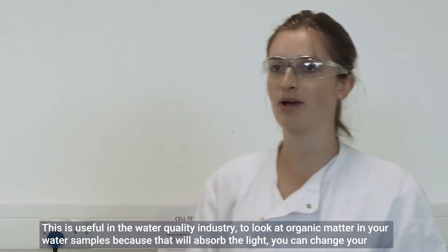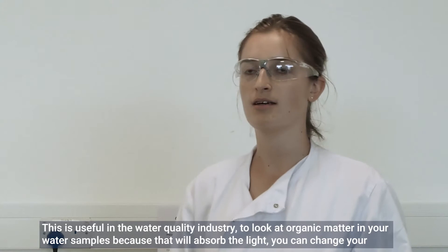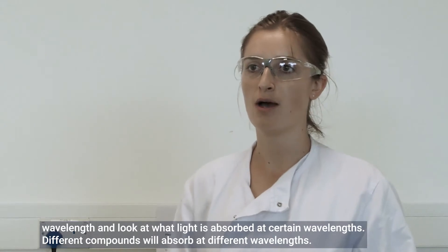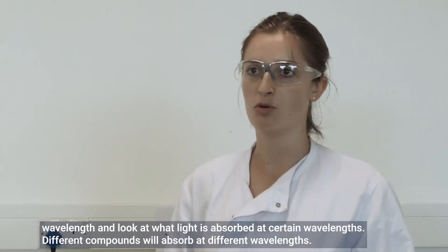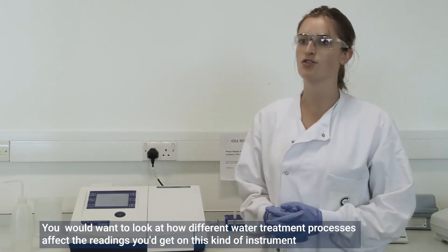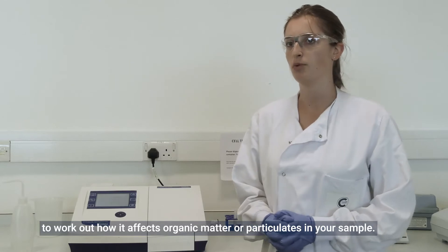This is useful in the water quality industry to look at organic matter in water samples, because that will absorb the light. You can change your wavelength and look at what light is absorbed at certain wavelengths, as different compounds will absorb at different wavelengths. You'd want to look at how different water treatment processes affect the readings to work out how they affect organic matter or particulates in your sample.